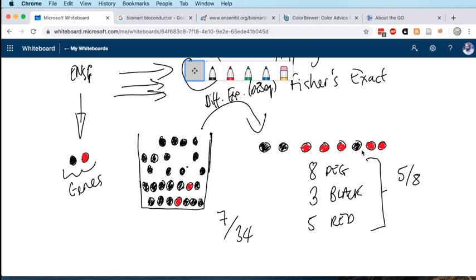Okay, so that's the hypergeometric test, and we're going to be using the annotation for the gene ontology with our knowledge of this hypergeometric test to find out whether we have any statistically enriched gene ontology terms amongst our differentially expressed genes.